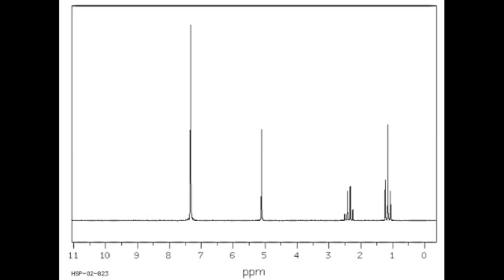So here we're seeing yet another molecule, and by now I hope we're getting good at this. So look at like 2.4. There we see, I guess, 1, 2, 3, 4 peaks. So that means we're looking for something that's next to 3 hydrogens, maybe something that's next to a terminal CH3 group. And at 1, further upfield, we're looking at maybe 1, 2, 3 peaks there.